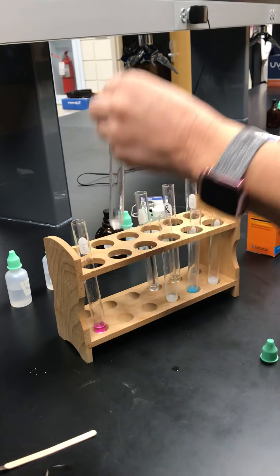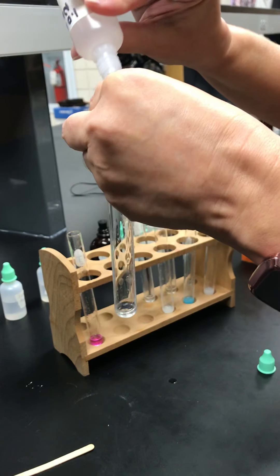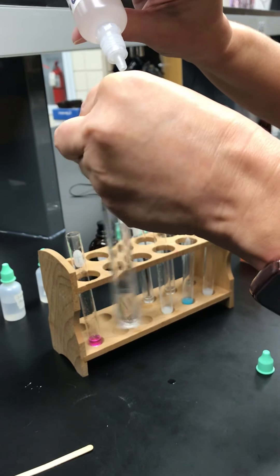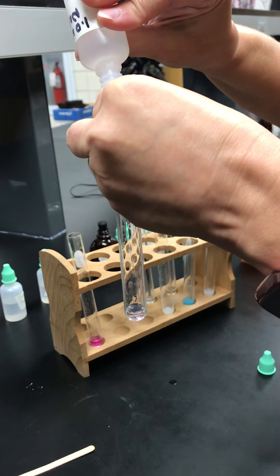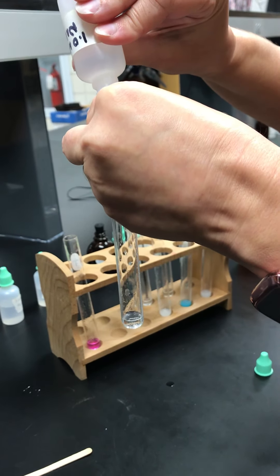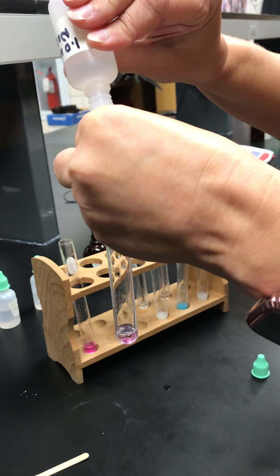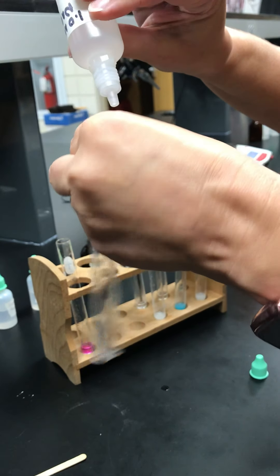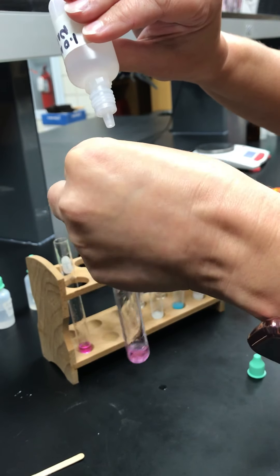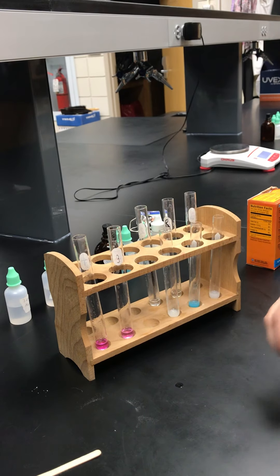Now I'm going to do the same thing with the H₃PO₄. That was 16 drops — so 16 drops for the H₃PO₄ — and that is the end of the lab.